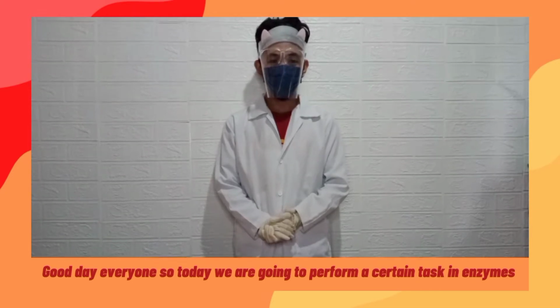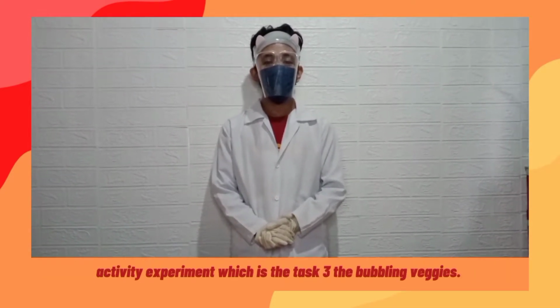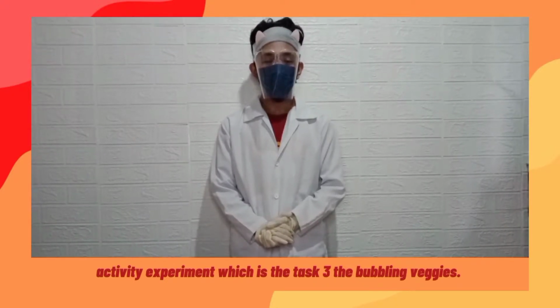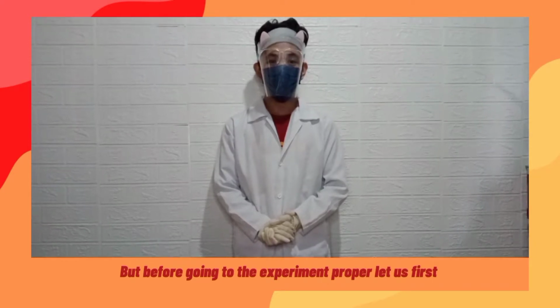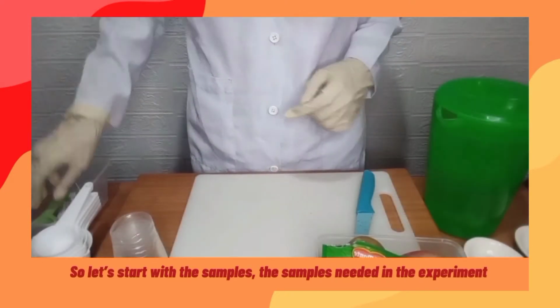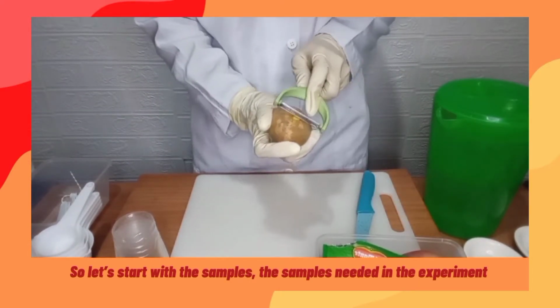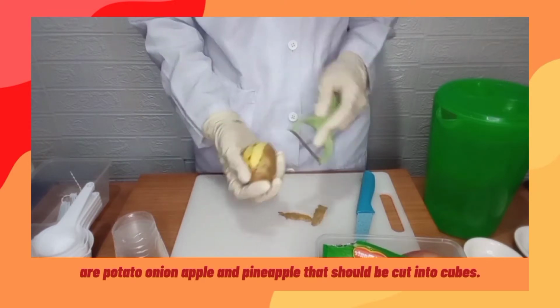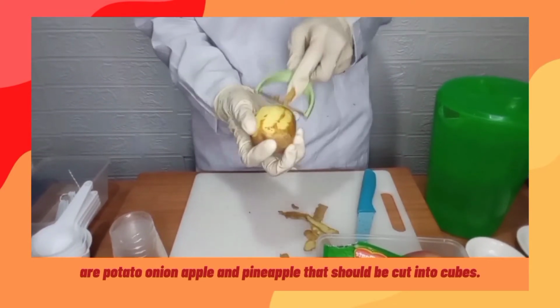Good day everyone. So today, we are going to perform a certain task in the enzyme activity experiment, which is task 3, the bubbling veggies. But before going to the experiment proper, let us first prepare all the things and samples needed. So let's start in preparing the samples. The samples needed in the experiment are potato, onion, apple, and pineapple that should be cut into cubes.